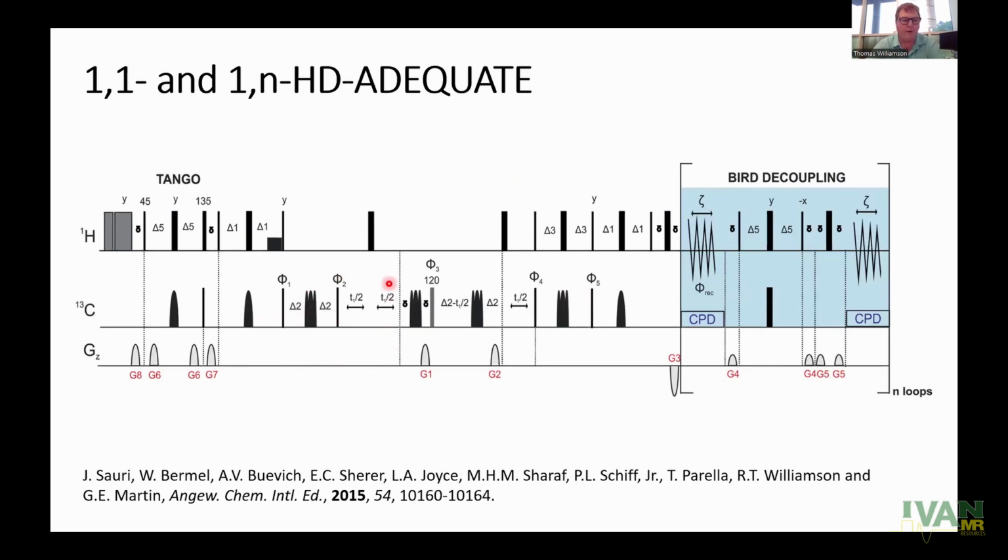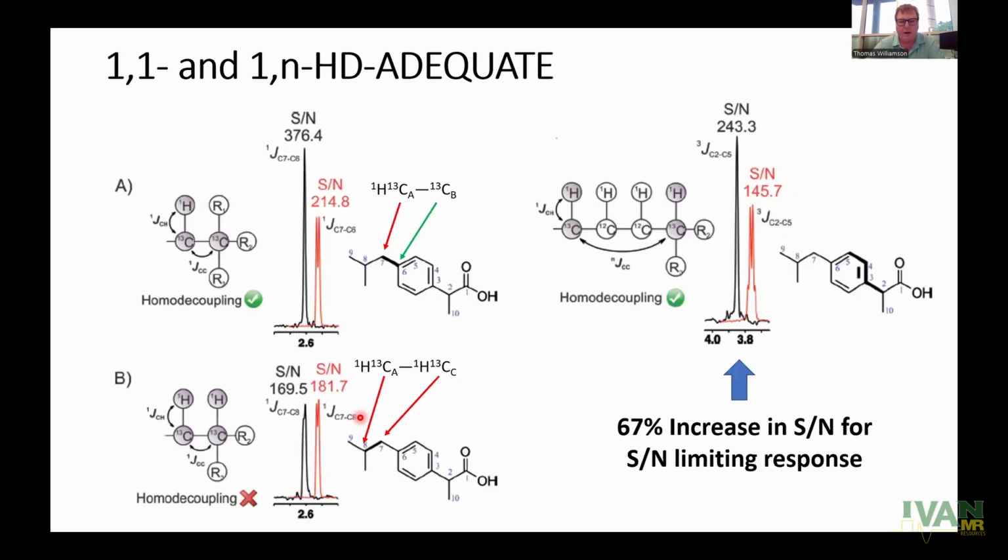This particular one here incorporates many of those developments, including the homonuclear band-selective decoupling developed in Gareth Morris's group, and a TANGO preparation period to help eliminate any residual magnetization and minimize artifacts from that origin. Still, this leaves a lot to be desired, although it does help collapse these multiplets and increase our signal to noise.